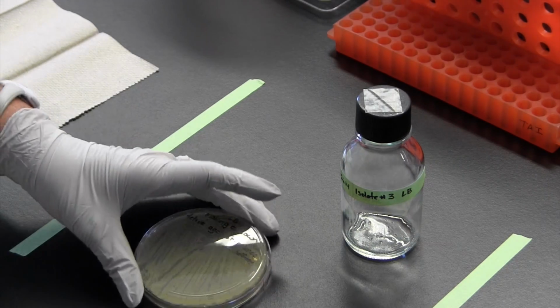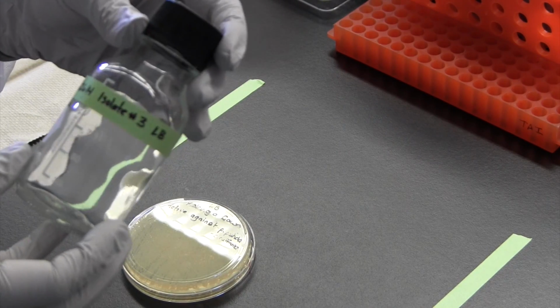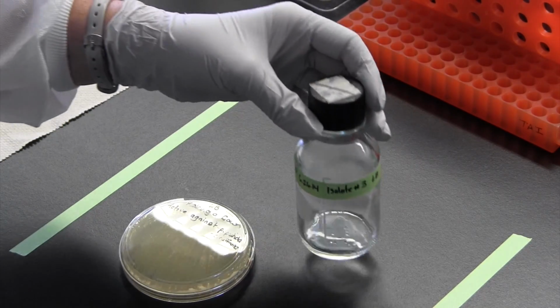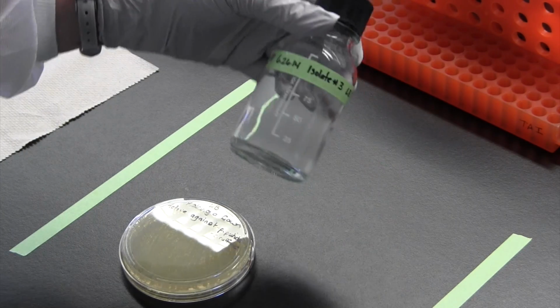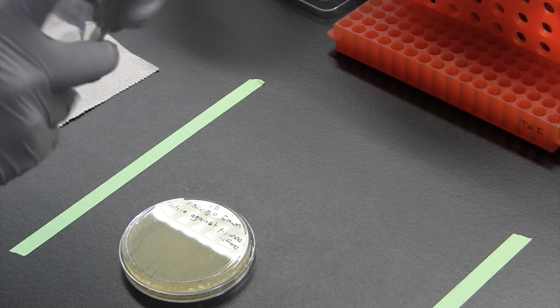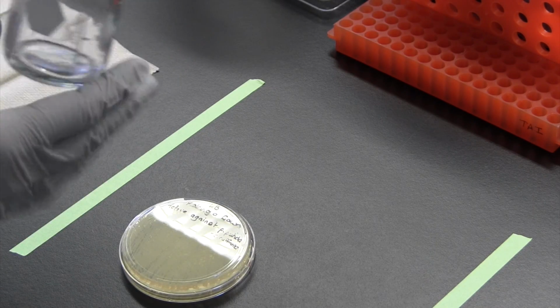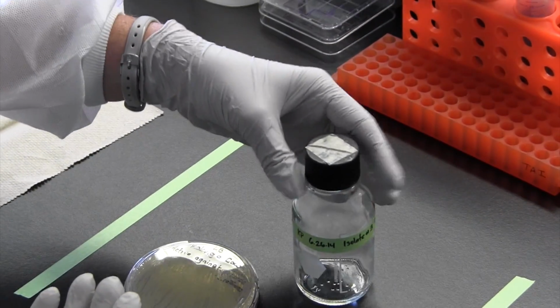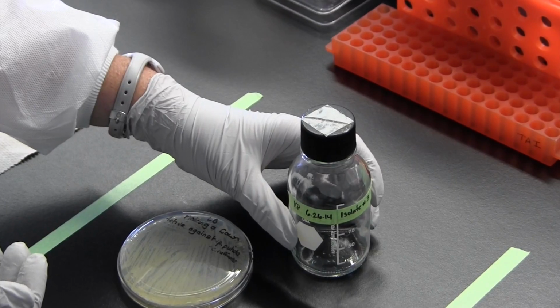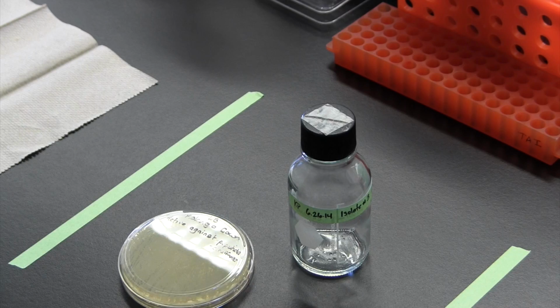So what you're going to need for this essentially is your lawn of bacteria, a glass bottle. Everything that we're doing working with solvents is going to have to be in glass from this point forward. It's really important because if you use a plastic, your solvent is actually going to extract plastic. And in that vein, if you use a glass bottle, be sure that you're never going to invert it into the cap unless you're working in some type of chemistry lab where you have the right equipment. We're going to chop up our lawn of bacteria and agar and put it in the bottle. Once you have it in the bottle, you really want to make sure that it stays upright. This is also going to prevent any solvent from leaking out the sides because these aren't super tight seals.